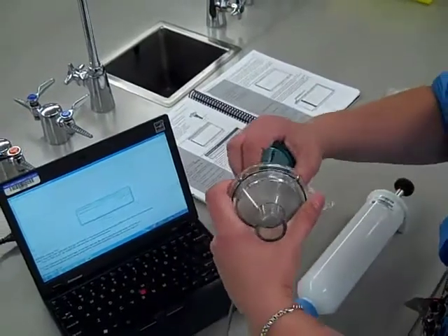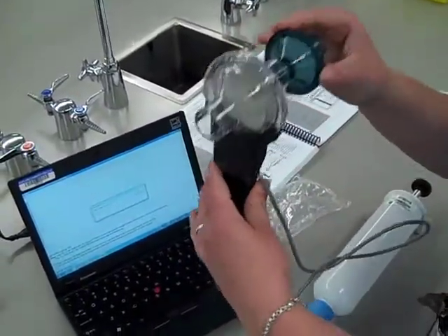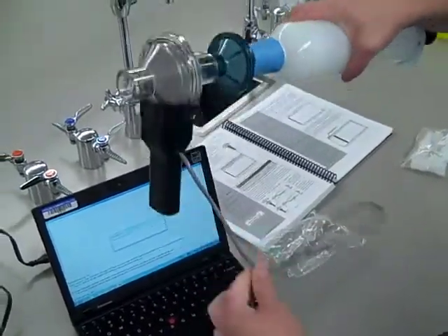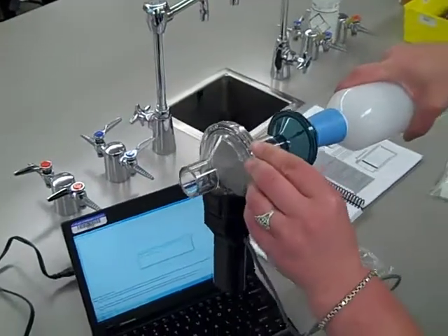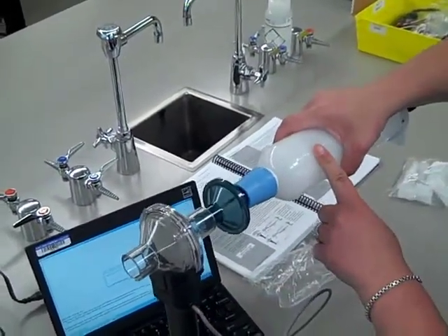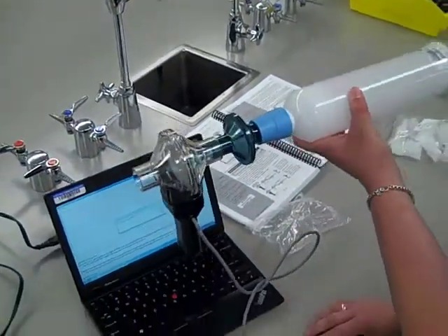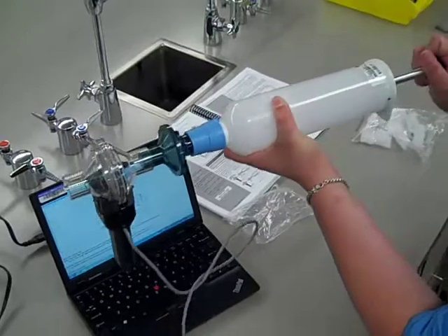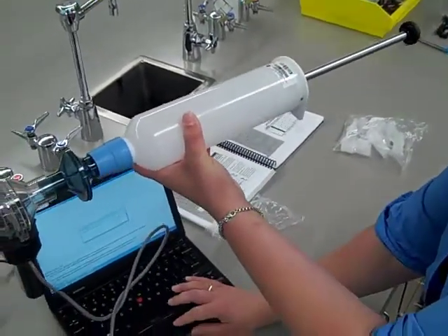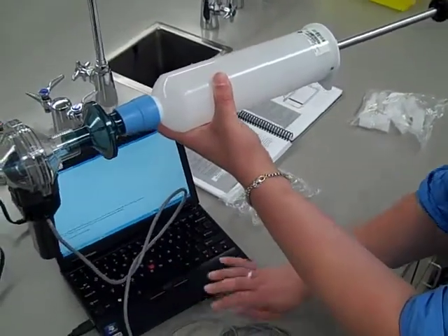One per person. They're disposable. And if you have it set up correctly, when you're holding it, the cord will be facing toward you on the transducer. Then you'll have the filter, and then this is the calibration syringe. So that's the proper setup. You're going to hold it like this, pull the handle all the way out, and then it's ready to calibrate using the syringe. So that's when you'll click OK.